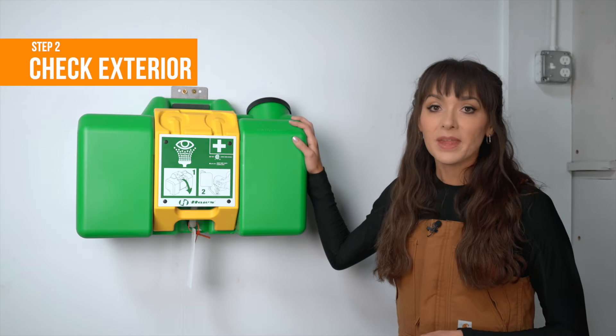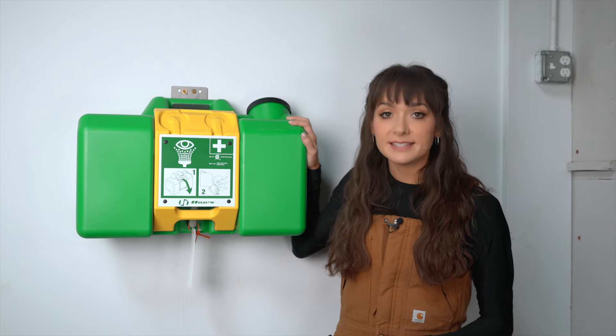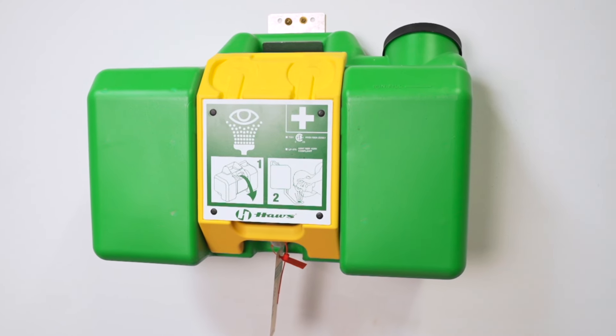Check the exterior. Examine the overall condition of the eyewash station, looking for any signs of damage, leaks, or corrosion. Keep it clean and dust-free to make sure it's ready to use if you need it.